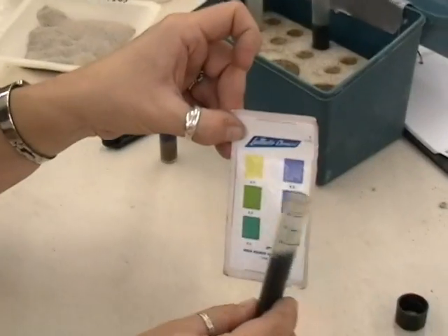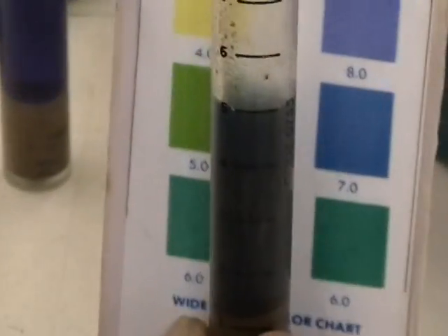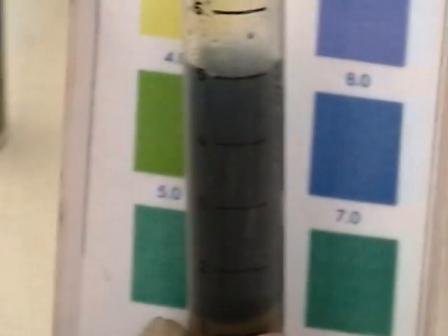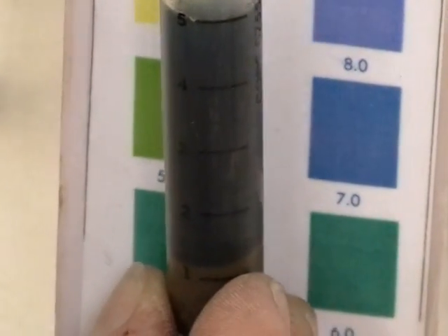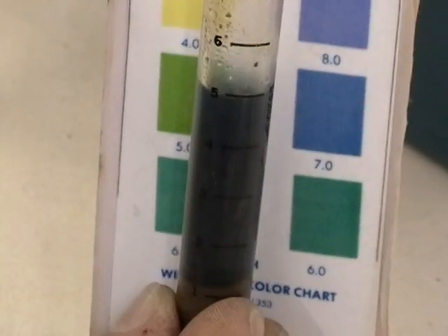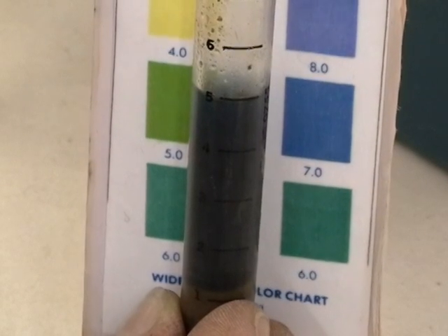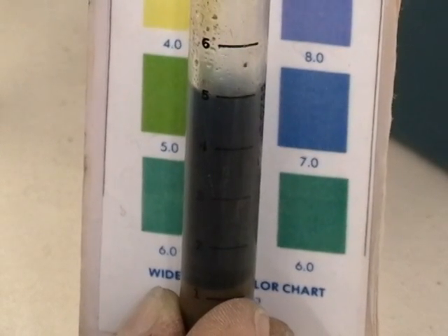If we were to look at the second vial, we're looking at a kind of greenish development. If you've got a lot of clay in your sample, you might need to let the sample settle a little bit longer because the clays stay much longer in suspension. It's closest to the dark green, which would give us a general pH of around a value of six.